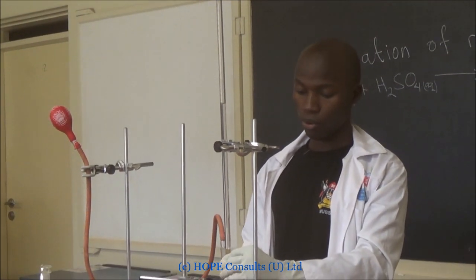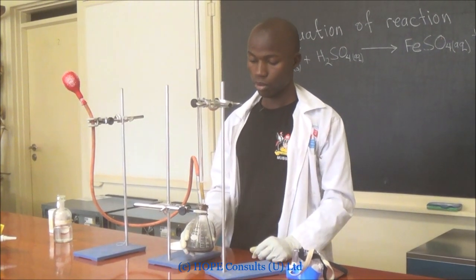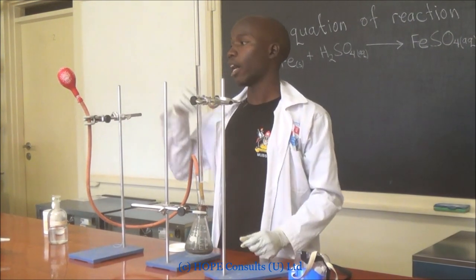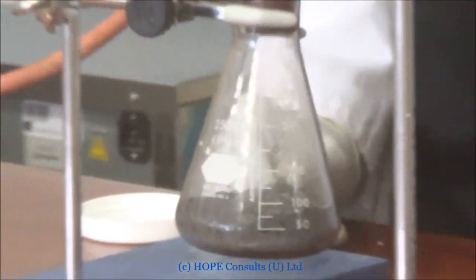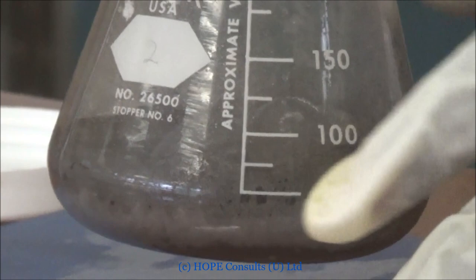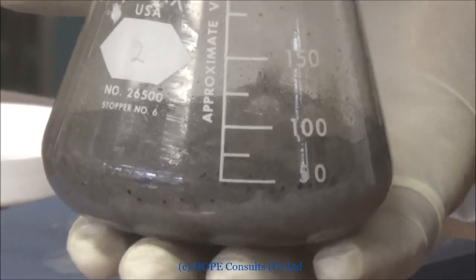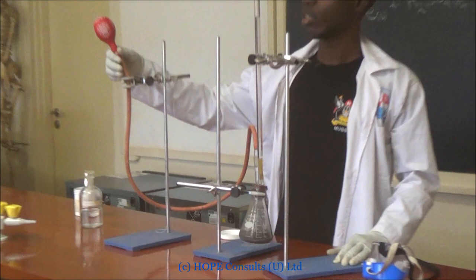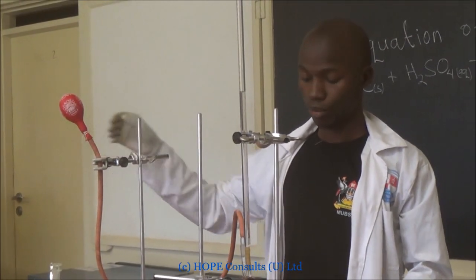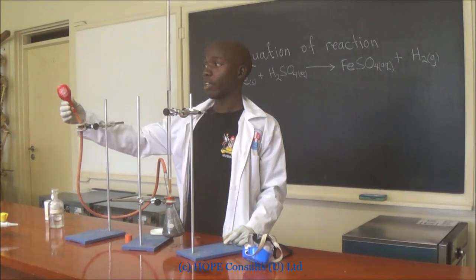I release more acid. The gas is evolving here and it is collecting in this balloon. What is being produced here is hydrogen gas. The gas is feeding into this balloon.